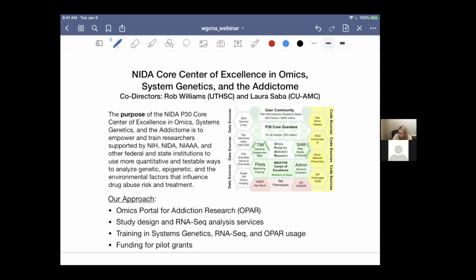So there's a few different things. The first one is normalization of RNA-seq data for WGCNA. I can go ahead and give my opinion on that. There's a couple options out there. You can do something like a regularized log transformation or a variance stabilizing transformation, which gets that RNA-seq data to look at least a little bit more normal. And then you can use tools like a Pearson correlation, or you can go straight from something like a TPM, but use a non-parametric correlation.